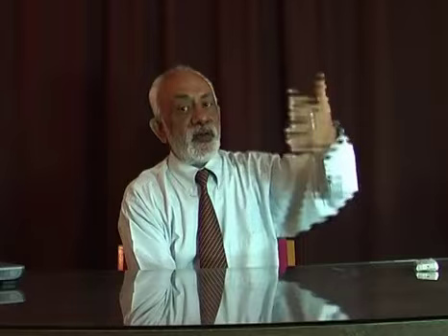If you are sitting near the biosafety cabinet and the power goes off, gently turn yourself away, breathe in the other direction, look in the other direction, and don't move unnecessarily. Wait for the power to come. And once the power comes, wait for the system to stabilize for at least 5 to 10 minutes before you resume your work. As I said, the exhaust system is on through a UPS. Therefore, the work surface integrity, the biocleanliness in the work surface, will never be compromised.